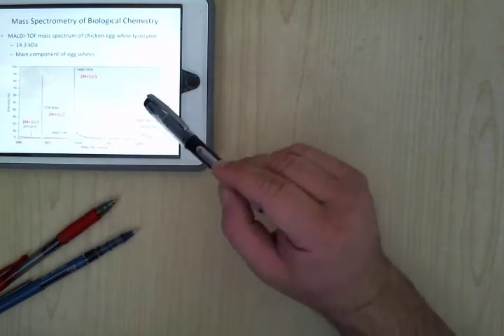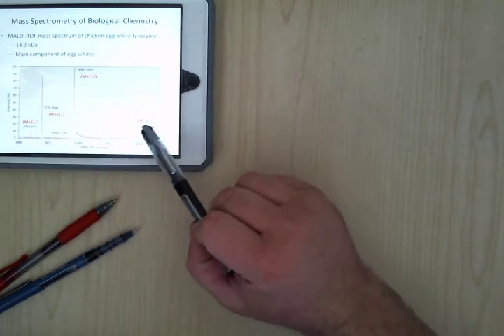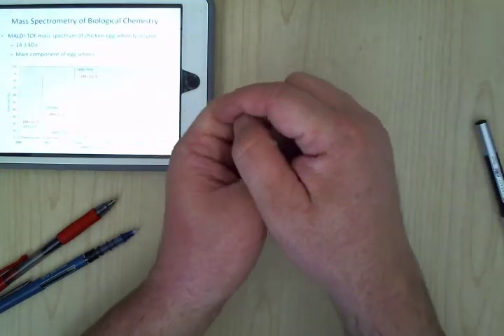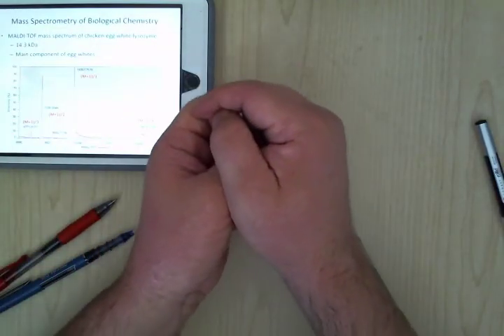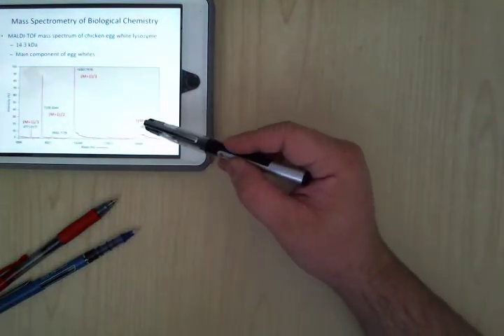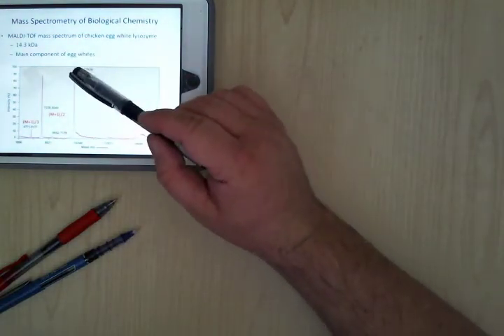Also sometimes what will happen is 2 of the proteins themselves will glob together, and then it'll get a positive charge, and it'll go half the speed. You pick it up here, but this is just 2 of them globbed together, so you get a dimer here, and then your proteins.